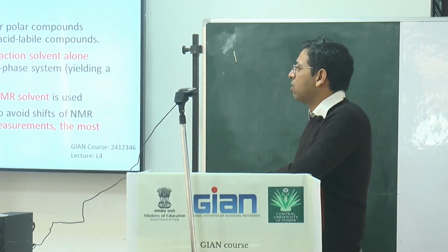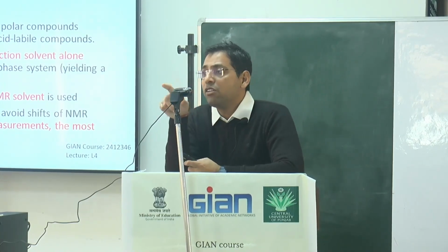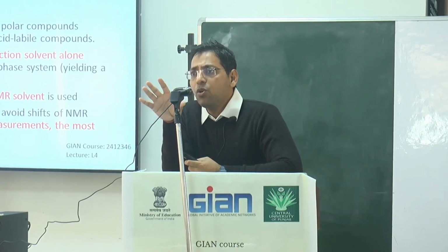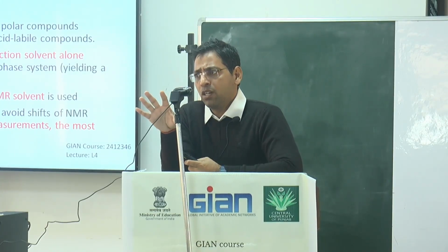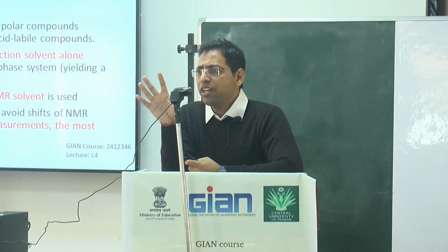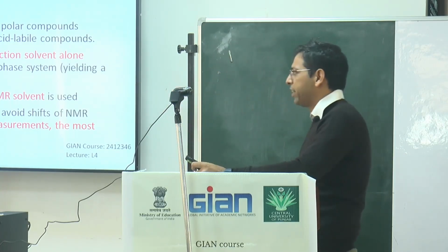Aqueous methanol you can use in combination with chloroform also. Yes, if you are using it with chloroform, you are covering many components which are polar as well as non-polar. So you will get better coverage of the metabolites if you are working in a two-solvent system, in which one is used for the polar and the second is used for the non-polar components.